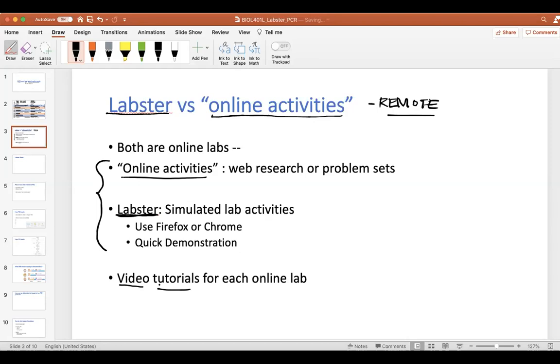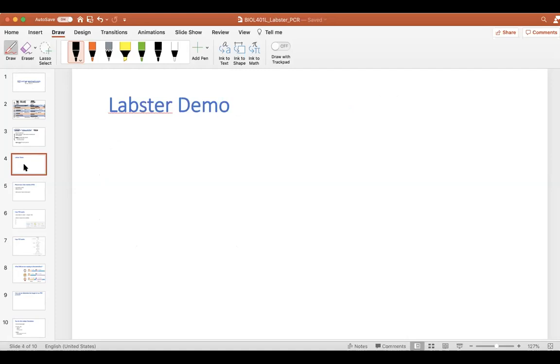Obviously, if you still have questions after viewing the video tutorial, you're certainly welcome to contact me via email, phone, or when we're in person, and you can also contact Dr. Bauer because we are teaching very closely this semester. Okay? Now this week, what you have been assigned is a Labster activity. So you're going to be working in this online sort of virtual video game environment, and you're going to be conducting an experiment using the polymerase chain reaction. So what I'd like to do is to show you a little bit about how the Labster platform works.